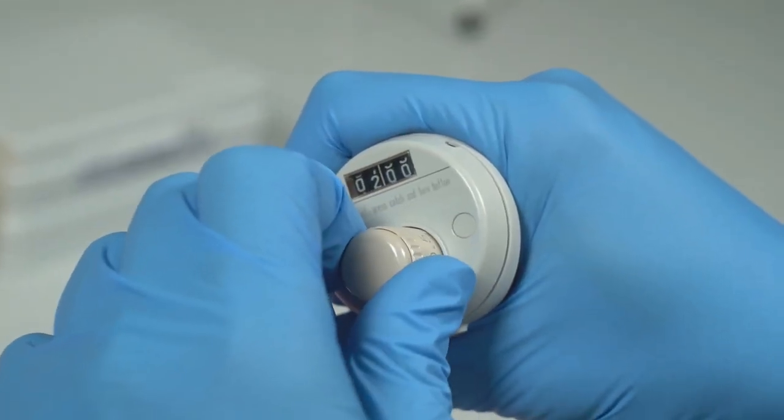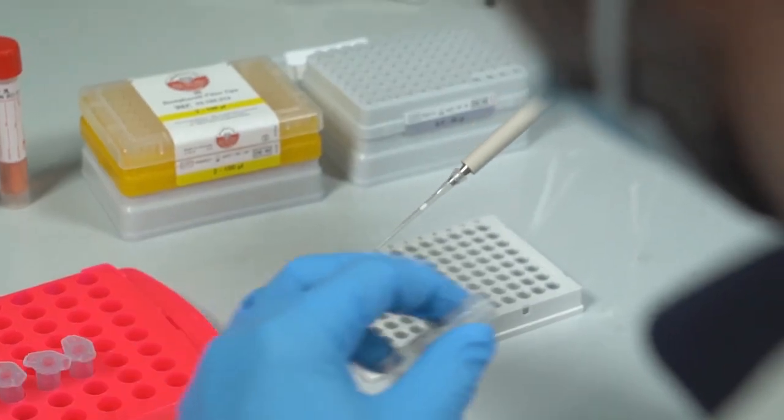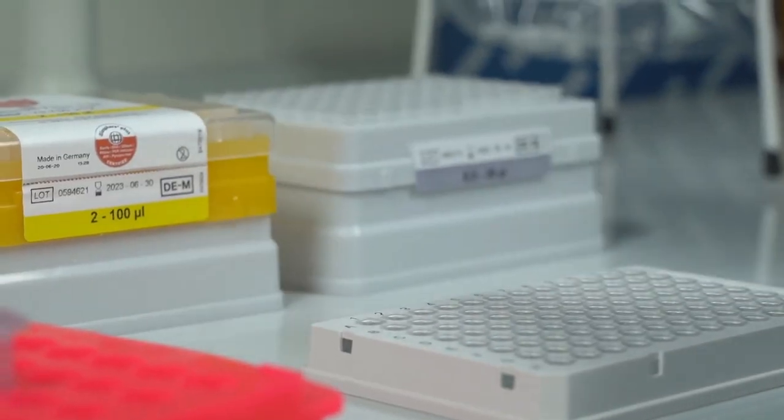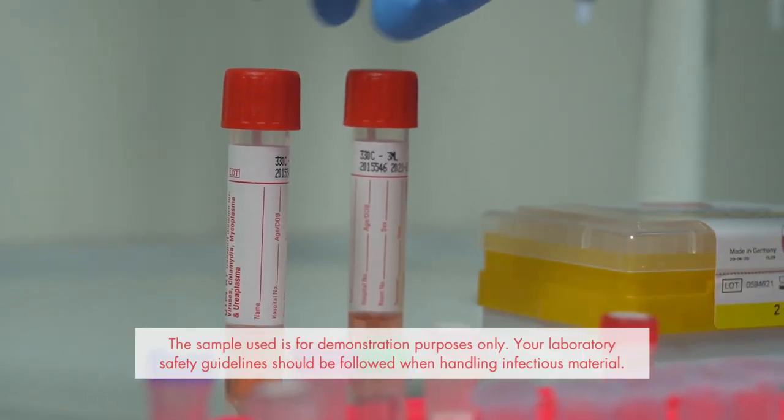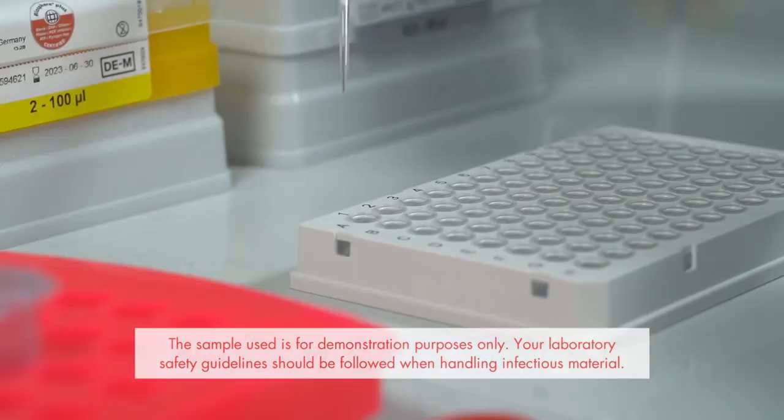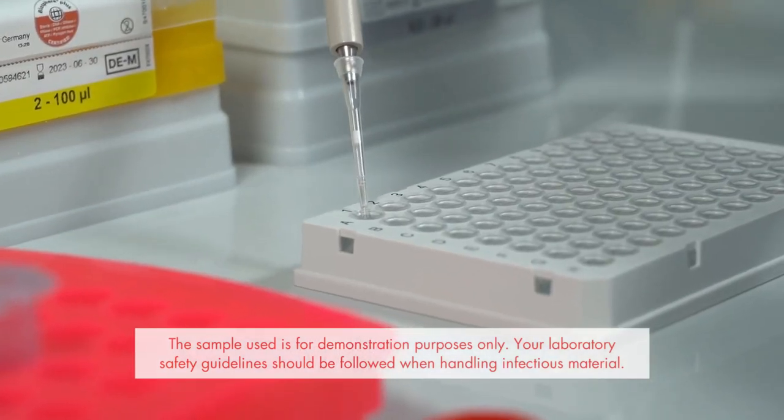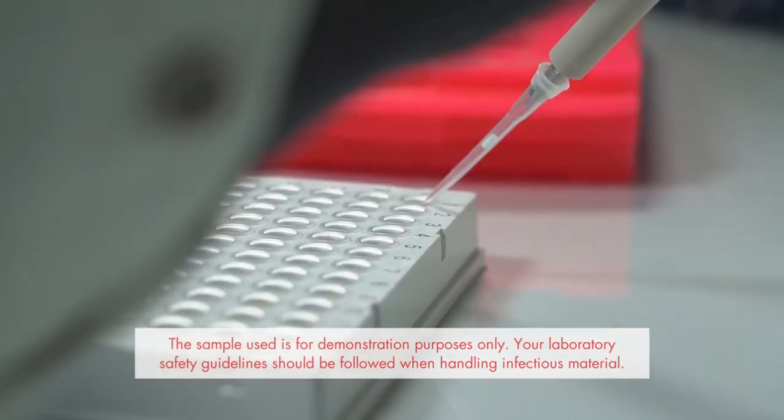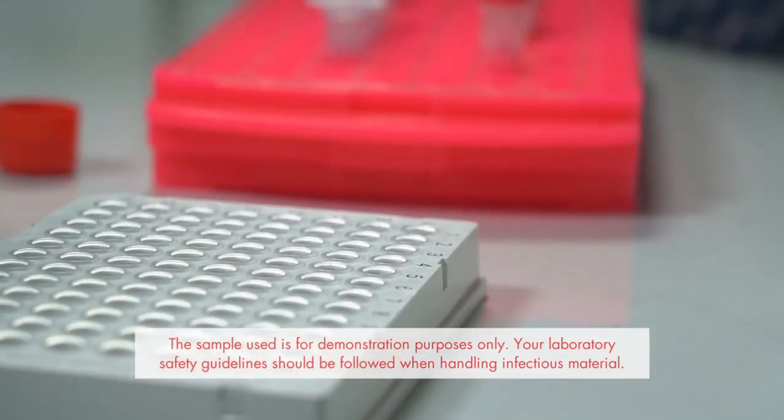Dispense two microliters of viral RNA prep buffer into each PCR tube or well of a PCR plate. Add eight microliters of the sample such as nasal, nasopharyngeal or oropharyngeal swabs stored in transport media such as UTM, VTM, PBS or physiological saline to the same PCR tube or well containing the viral RNA prep buffer.